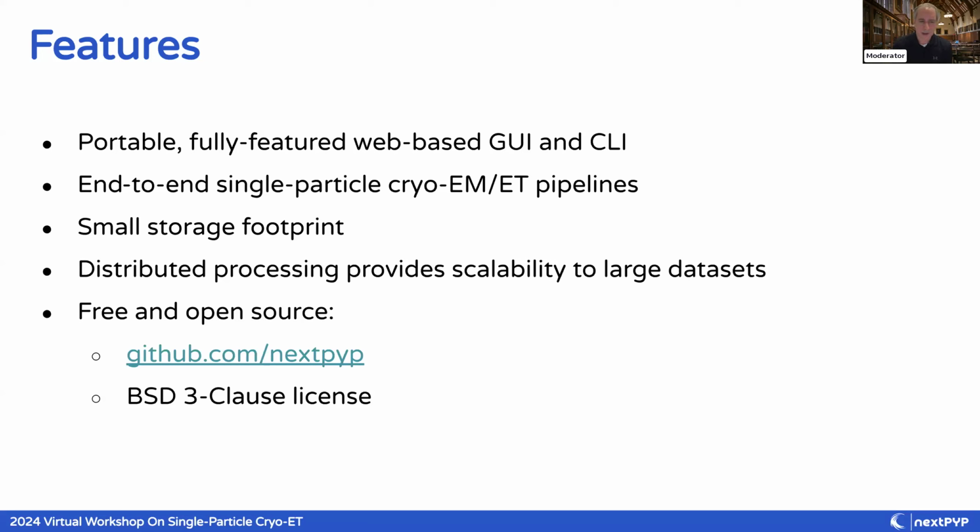In addition, it also has a distributed processing architecture, which allows us to scale the data analysis to very large data sets with potentially thousands of tomograms. It used to be that data sets of that size, we couldn't possibly do in a reasonable amount of time, not very long ago. But by adopting this distributed processing strategy, we can manage very, very large data sets and it's actually quite fast. And you're going to see some of that during the practical. If you attend that, you're going to see how that works in practice.